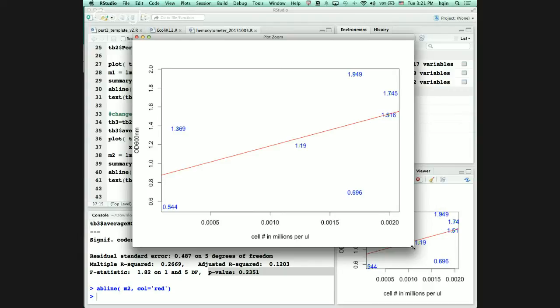Oh, it's great. Thank you. You have not extracted the file. Okay, now we go out the file again.